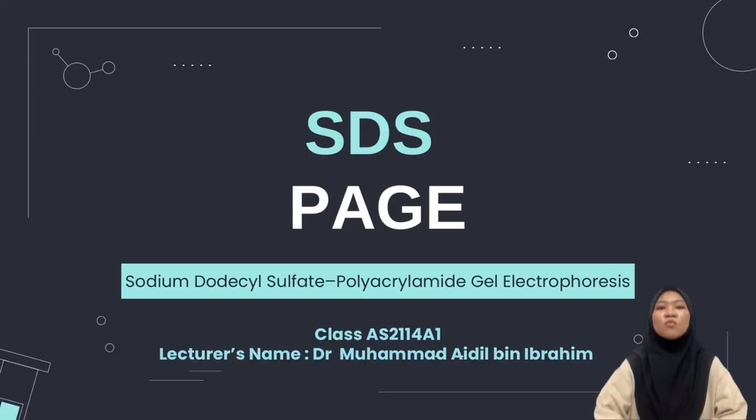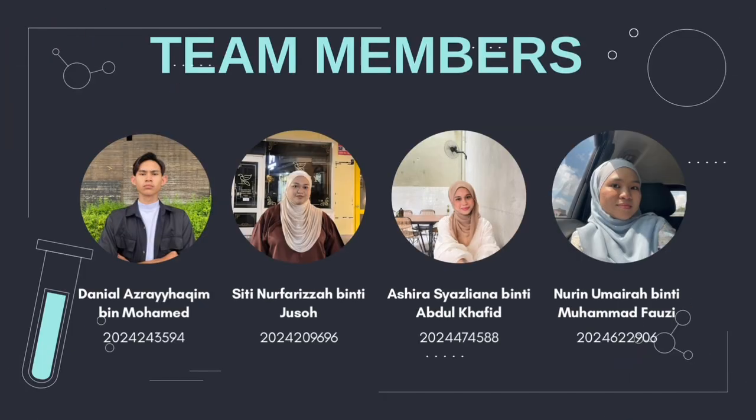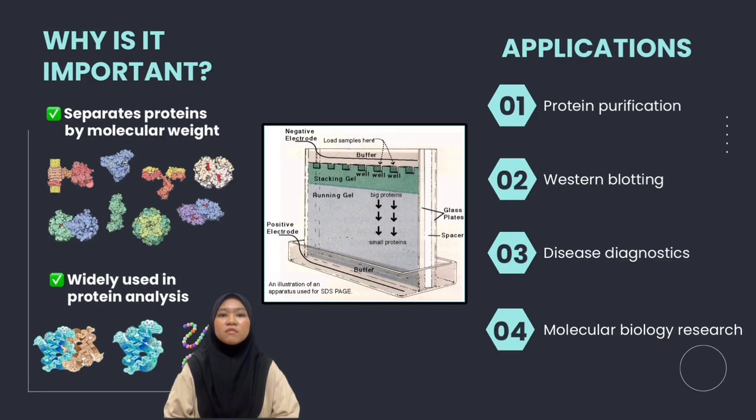Hello everyone, welcome to our demonstration of SDS-PAGE, which stands for Sodium Dodecyl Sulfate Polyacrylamide Gel Electrophoresis. SDS-PAGE is one of the most widely used analytical techniques for separating proteins based on their molecular weight. It is an essential method in biochemistry, molecular biology, biotechnology, and medical research.